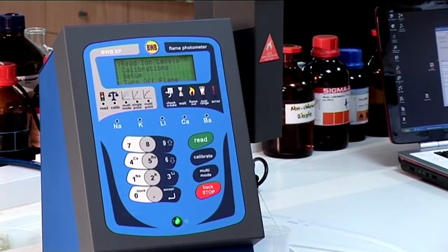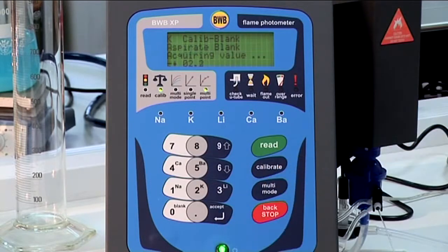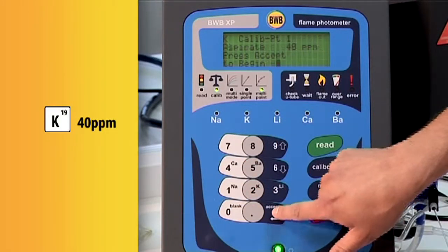The process is similar to the single point calibration, but when we are prompted for the number of points we will enter 3. Run the blank as before. For our first standard, key in 40 and start aspirating the 40 ppm potassium standard.